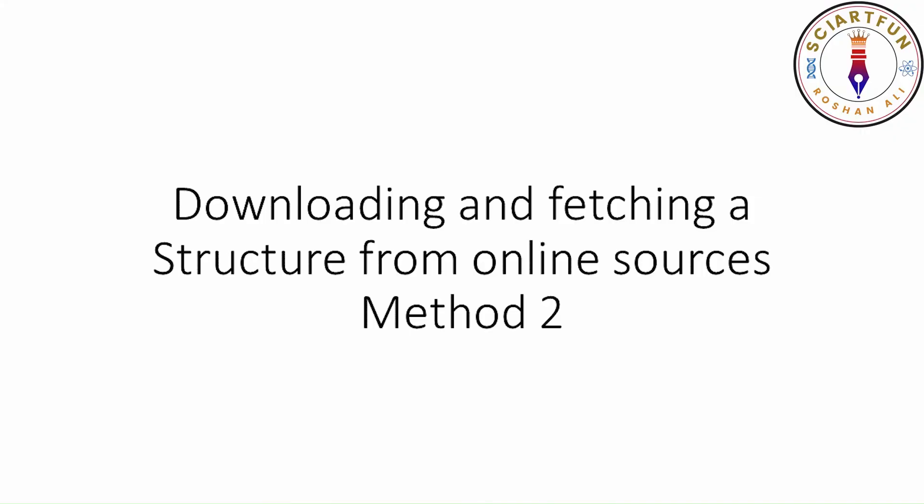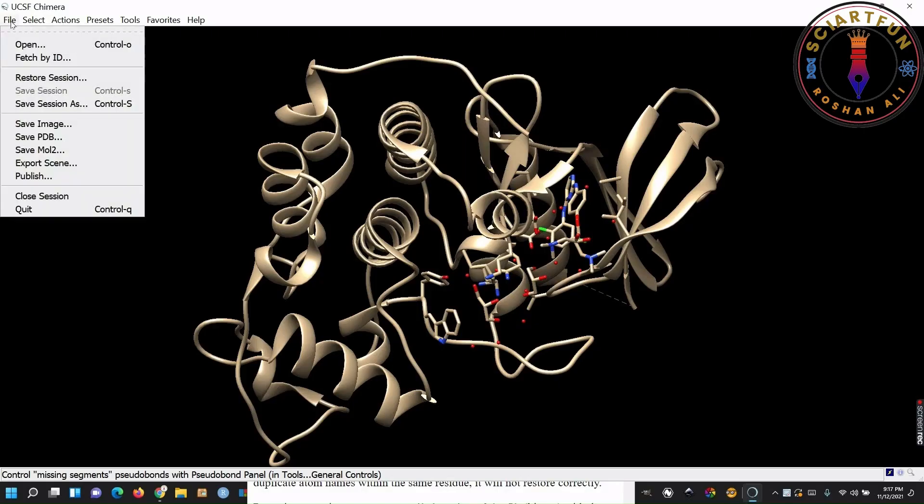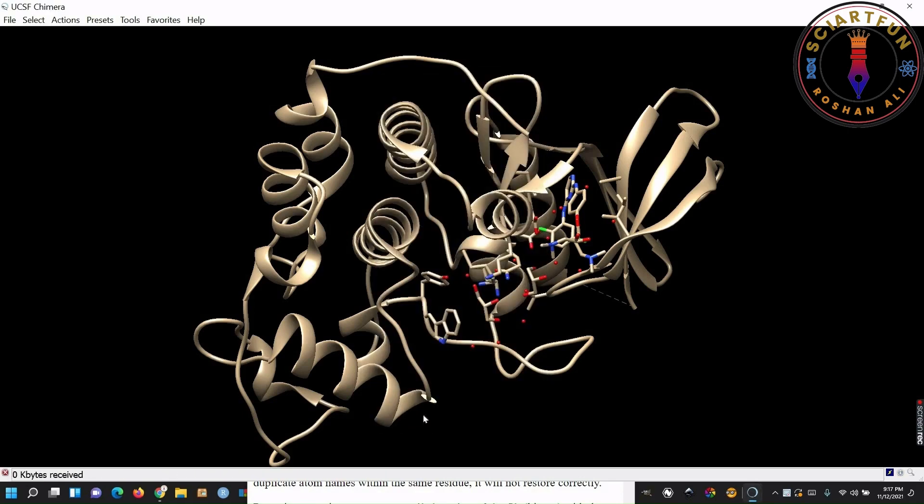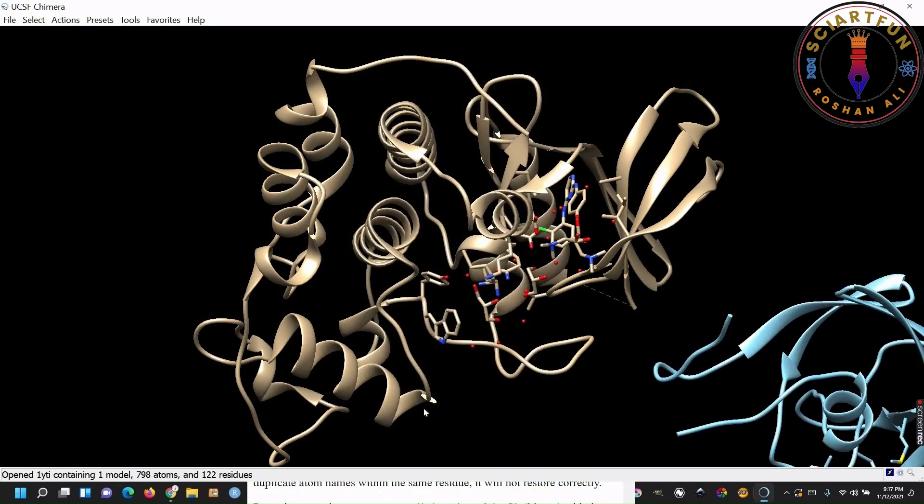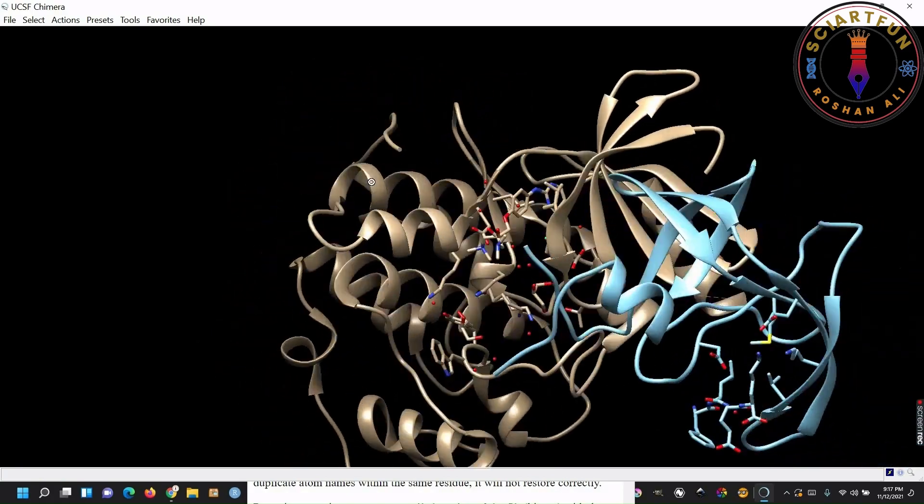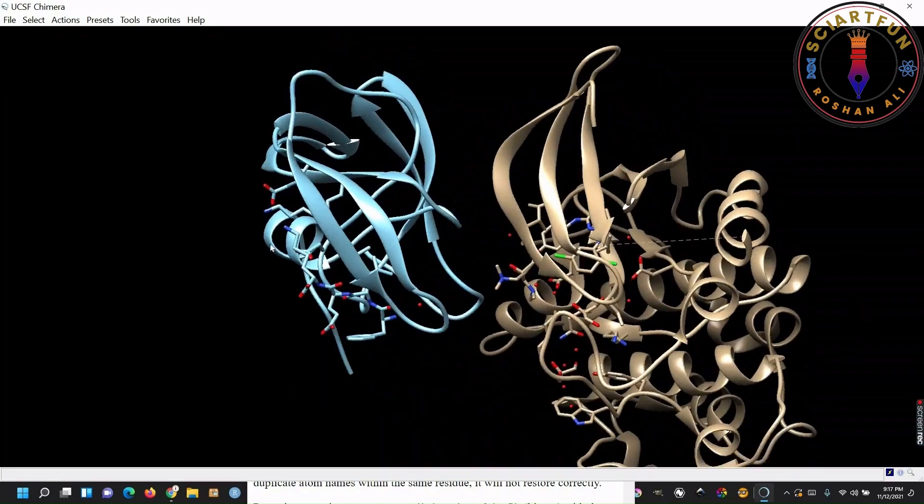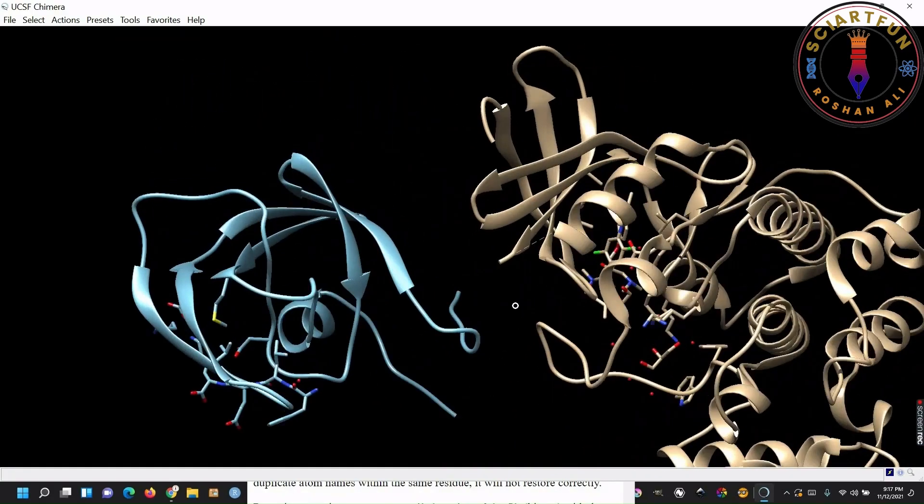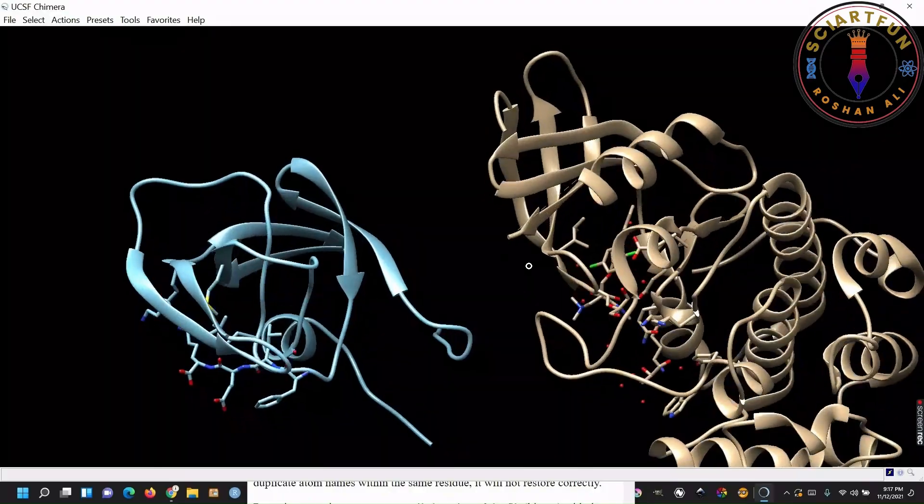In file menu, the second thing I am going to tell you is downloading the structure from online resources. Remember, this is the second method. In this method, you go to file menu, then click fetch by ID. The rest of the procedure is the same I showed you in method 1. The structure will be added to the already opened structure. You have to close the first structure, if you want the new structure to be opened in a new window.